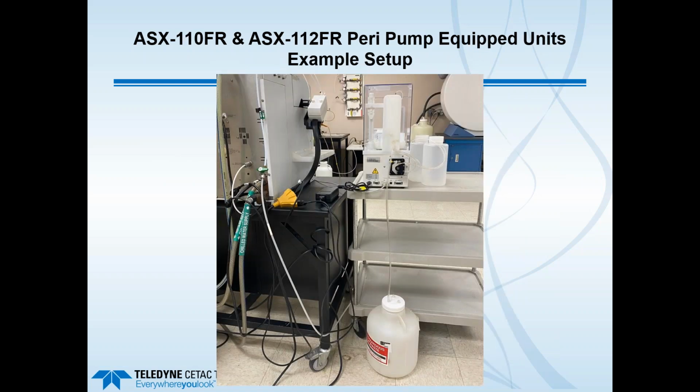So here's a little bit of expanded view showing an example setup of an Autosampler, in this case the ASX-112, on a laboratory cart. And on the floor, you do see an appropriate waste receptacle for the overflow from the gravity drain from the rinse station.